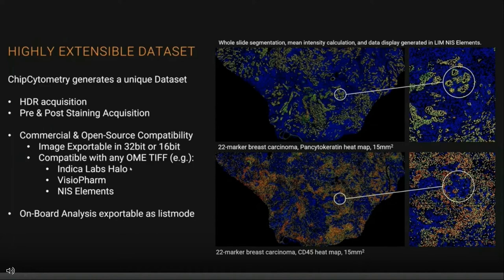We know, for example, that these datasets work very well with IndicaLabs Halo, VisioPharm, and NIS Elements. The reason this is important is that a lot of people already have pipelines they're using and they don't necessarily want to reinvent the wheel just to use our software. So instead, we just make the full raw image available to you in its full glory for easy import.